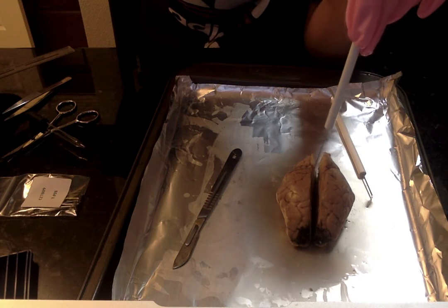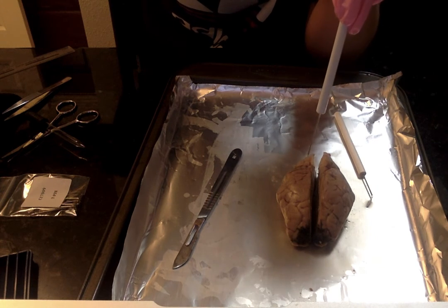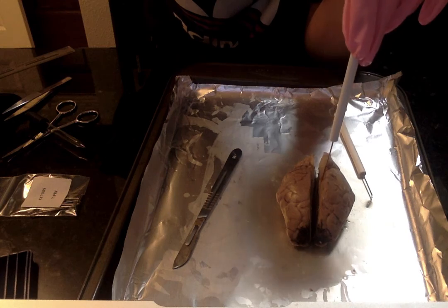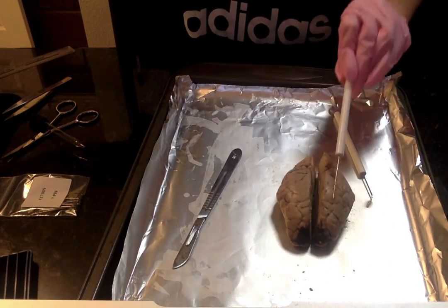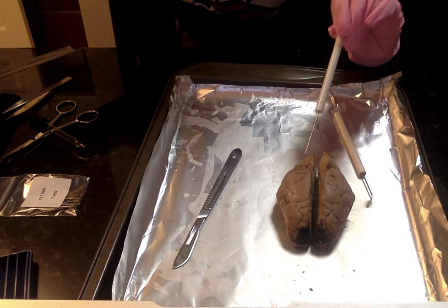The longitudinal fissure's essential purpose is to separate the brain into two different hemispheres, left and right. So yeah, it's basically right along the middle.